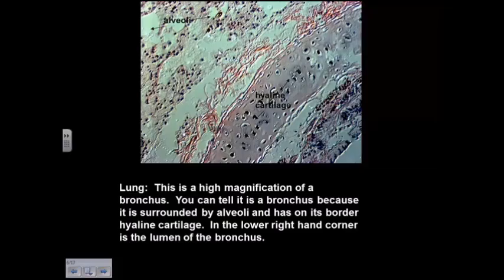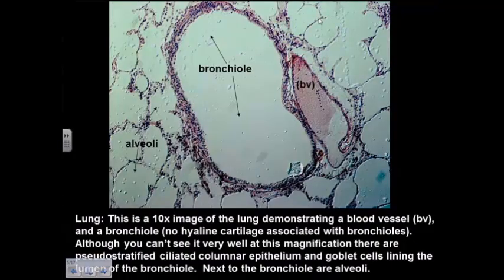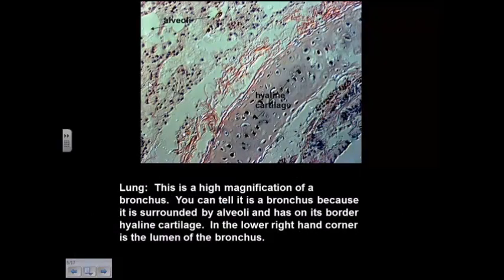Here's some alveoli out here, and this person has a problem. This is pathology. Okay, something's wrong here. This person probably has some sort of pneumonia because there's all kinds of stuff in the alveoli. And the alveoli don't have this nice, sharp, defined architecture like in this healthy lung. So this is a problem. Okay.